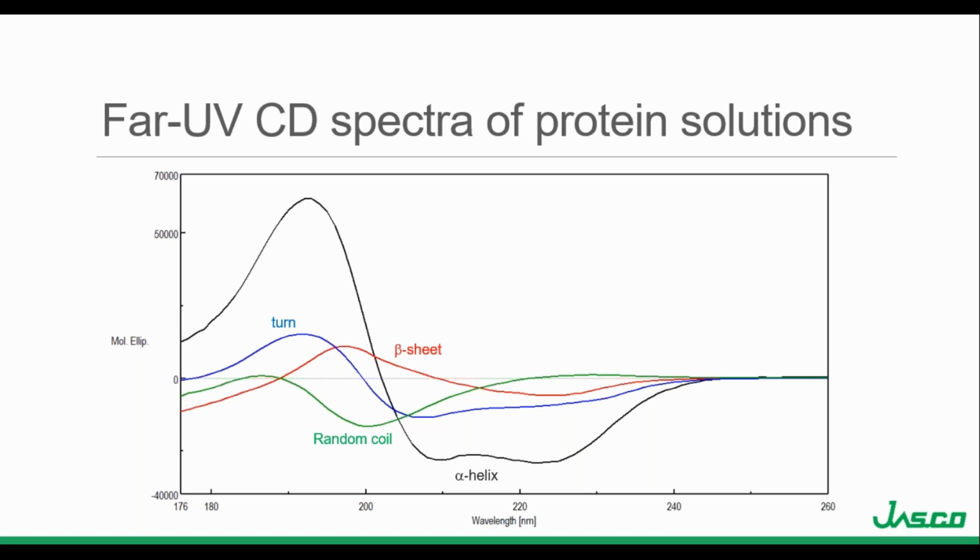So it's really important to note that the characteristic wavelength peaks are ranges, they're not exact values, because these peaks are going to shift in wavelength depending on the component percentages that make up the CD spectrum. And that is going to depend on the protein's interactions and stability.